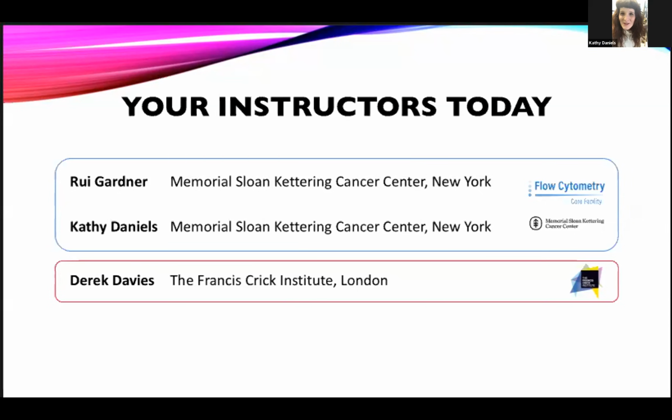All right. Thank you so much, Rui. As Rui just mentioned, my name is Kathy Daniels. I am the flow cytometry core facility manager here at Memorial Sloan Kettering Cancer Center. I've had the privilege of working with Rui for about 2 years now, which I'm very grateful for. I started in flow cytometry roughly 7 years ago this month, so this is my 7th anniversary.